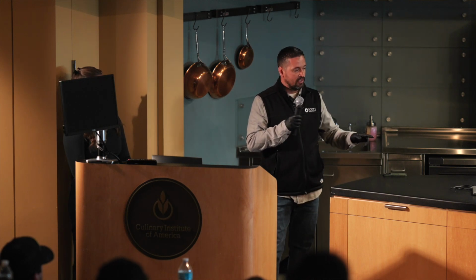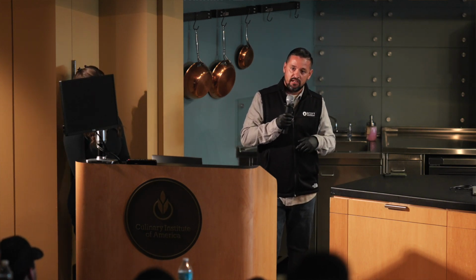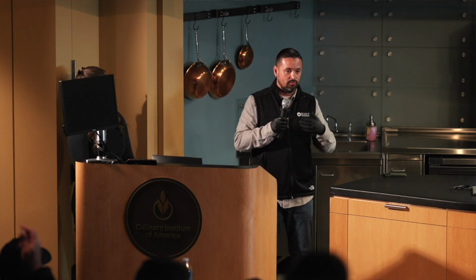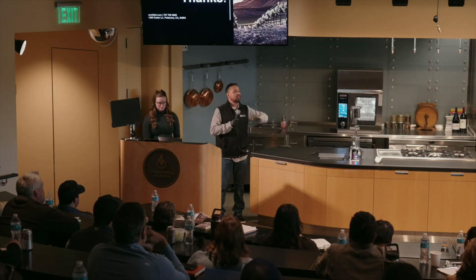One big thing I want to touch on really quick is the filter discs themselves. Sometimes there's going to be three different papers that come in the filter disc. They do have to be inserted into the support chamber a certain way. So just getting the disc, putting it in there, there's an inlet side and an outlet side. So think of your sheet filter, just like you have the rough side, the clean side, inlet side, dirty side. And I have the disc set out up here. So after the presentation, you guys are welcome to walk up and take a look. Just don't touch, just take a look.